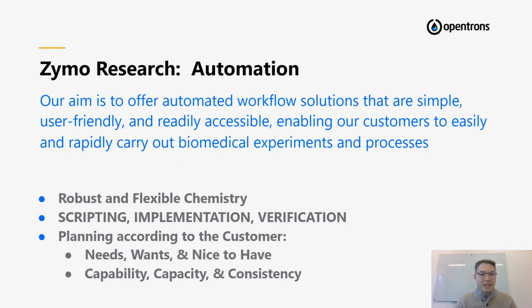The next step is implementation. That's, again, what Carlos is doing with his class. He's getting them working with the actual instrument. When you tell an instrument to pipette a certain amount of liquid, does it do it? And does it do it from the right trough into the right well? So that's just part of the process.